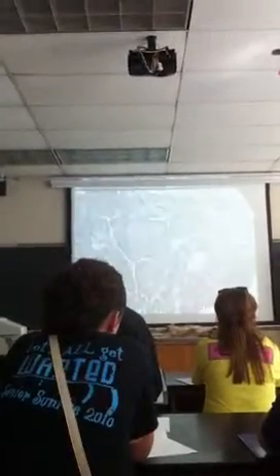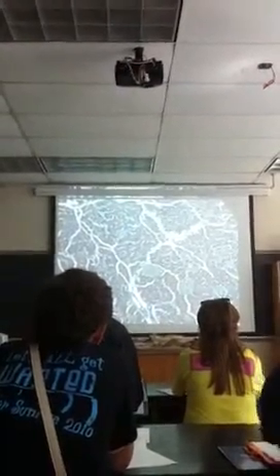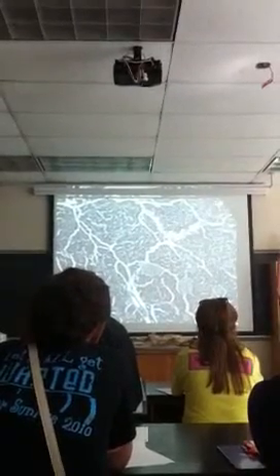I also have all the slides out on the scopes. So what I'm going to be eventually doing for your participation grade is going to be related to the scopes. So you will have to look at it. Here, that's pretty bad. See if I can bring this a little bit. Yeah.